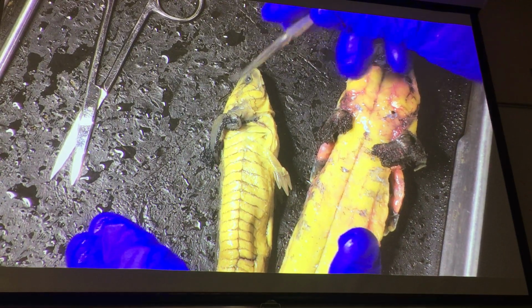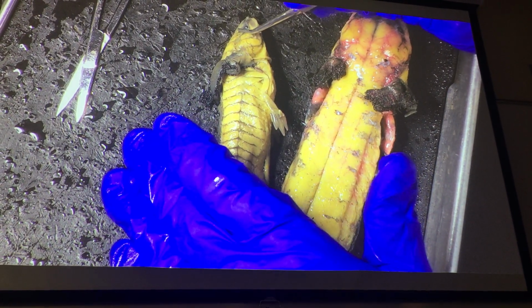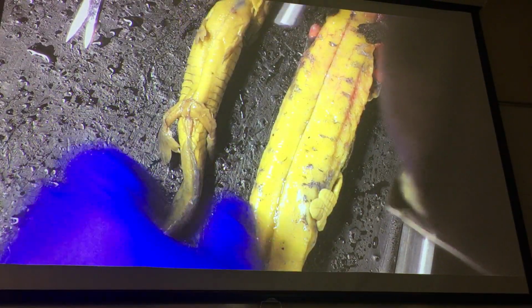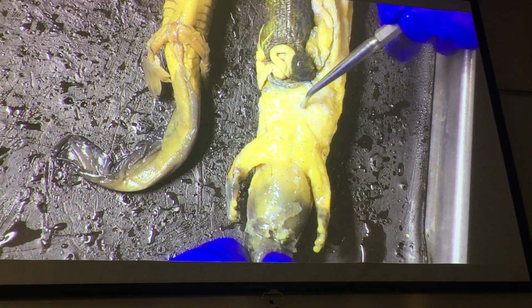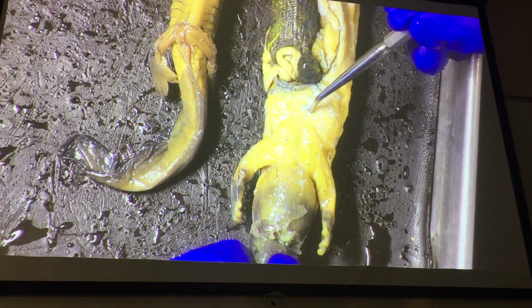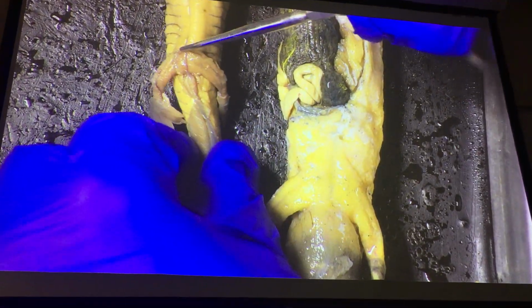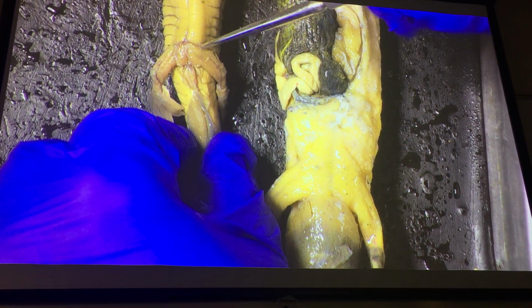All right, so we had some big differences on the head. Not too much in the upper body, but lower body with the legs, they're the same, but they look different. They look different because of the shape of the pubis. So if we come down here and look at full frontal salamanders, of course we can see how the pelvic muscles of our mud puppy come to a point, like you remember the pubis and pubo-ischiatic plate did. But if you look at your tiger salamander, there's no point. It's here, but it doesn't come up to a point.